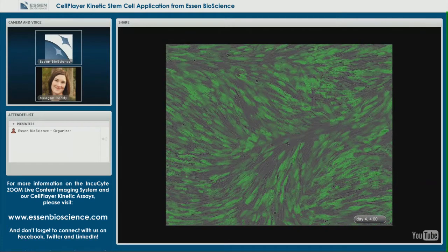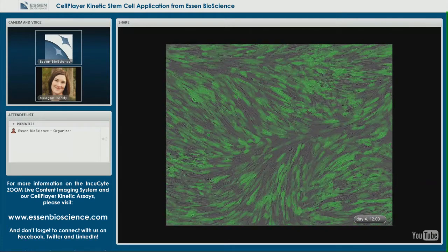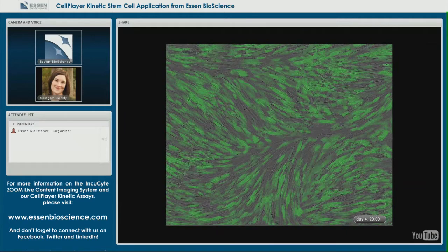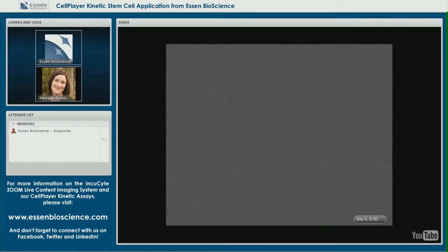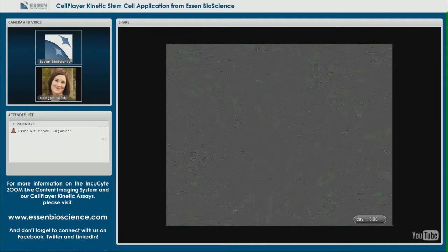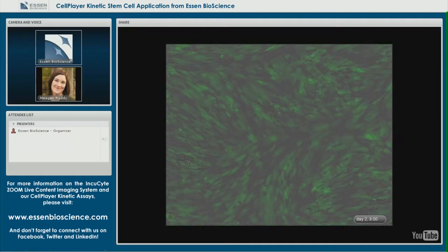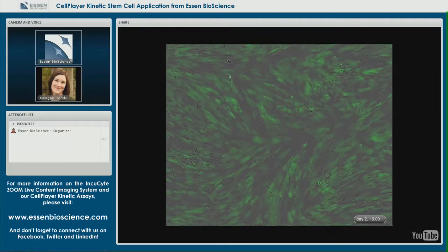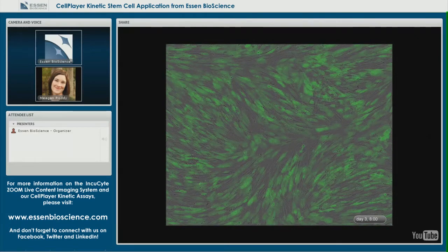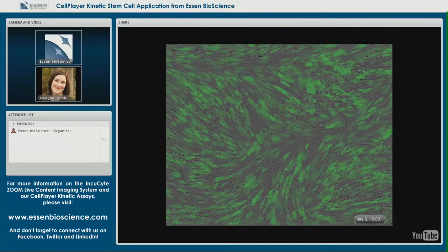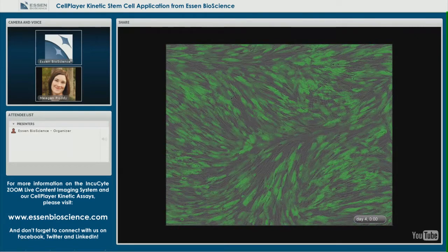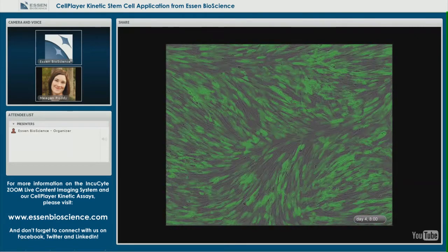These are neonatal foreskin fibroblasts infected by a GFP Sendai virus. Successful transduction allows green fluorescent protein expression. I'll allow the video to play a second time in case anybody is having viewing issues.